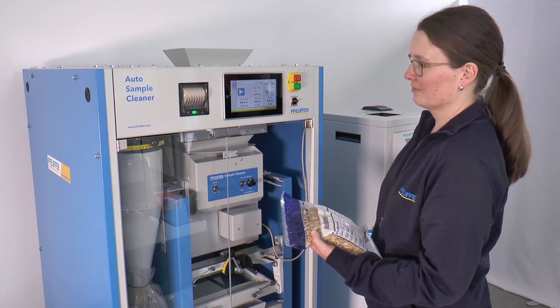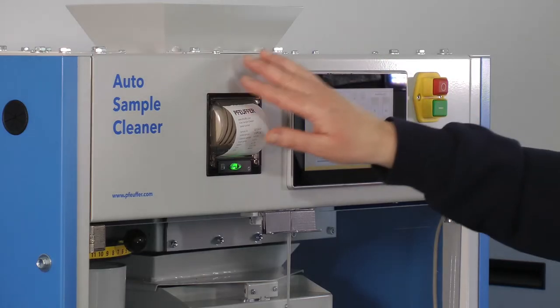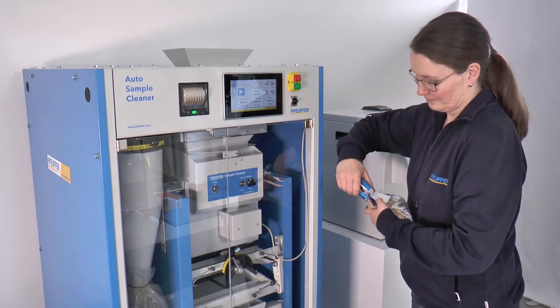By a single touch, you get a printed receipt. You can collect the samples in separate trays for further analysis, or let them fall together into a large material container.